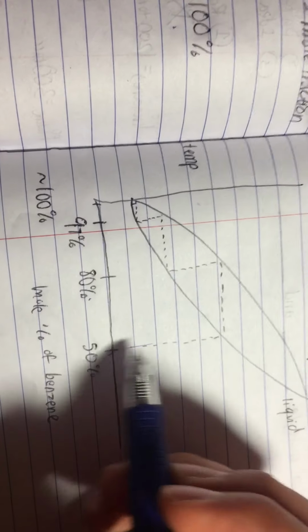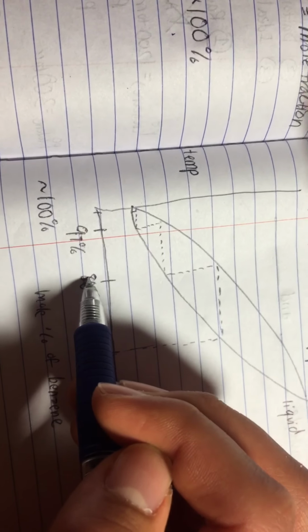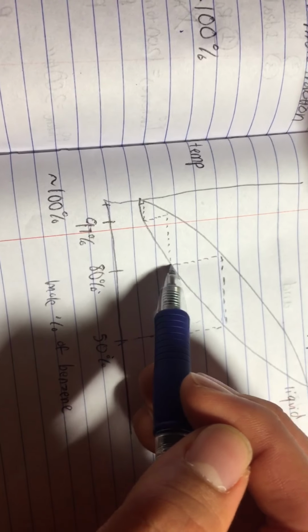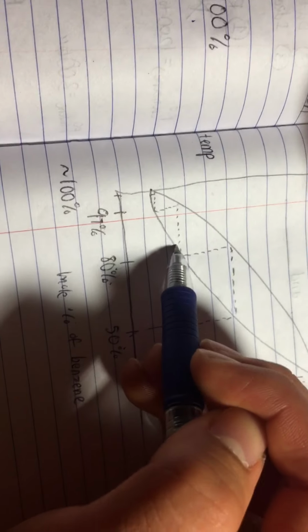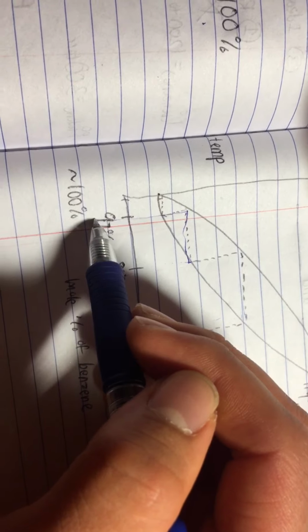That's the point. And this graph really demonstrates it, because let's say after that simple distillation, it's only 80%. But with the fractionating column, it's going to actually condense while still being in the fractionating column. So it's going to hit and it's going to be 80%, and then it might return into vaporization form. And what happens is we're going to get 97%.